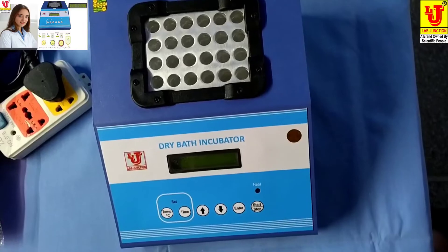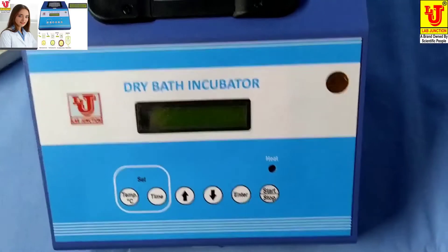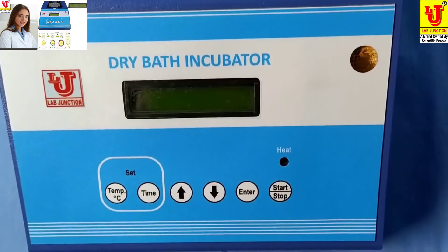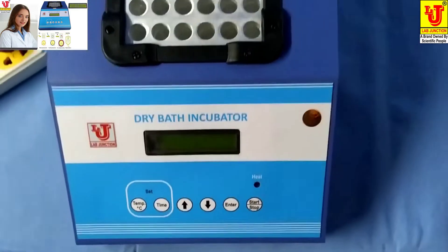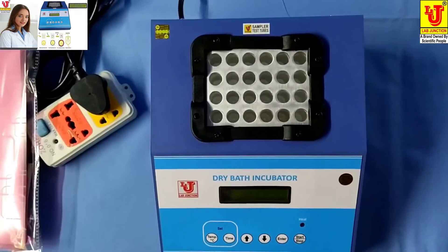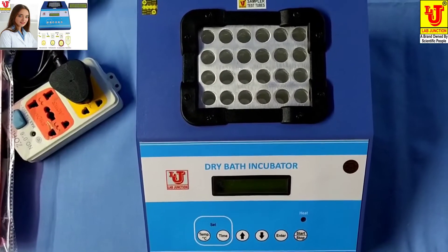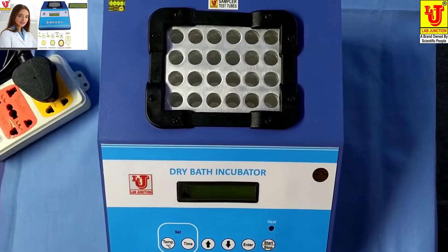Lab Junctions dry bath incubator. We have two models. The first model is LJ352, with a temperature range of 0 to 50 degrees centigrade. The second model is LJ353, with a temperature range of 0 to 100 degrees centigrade.